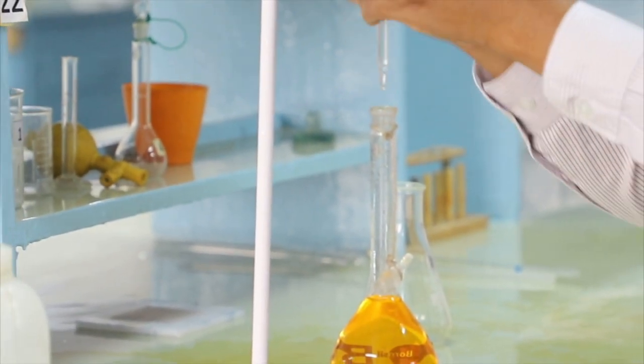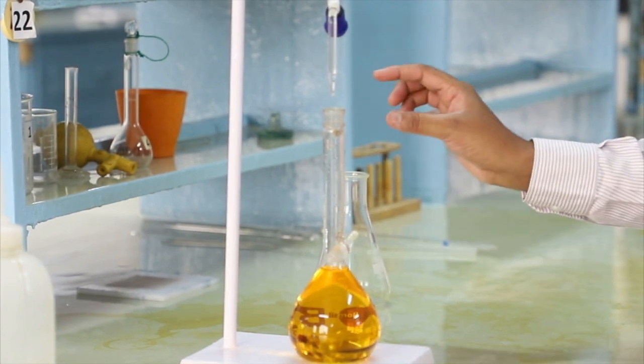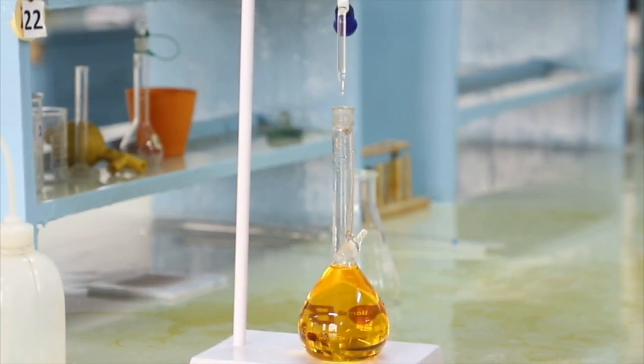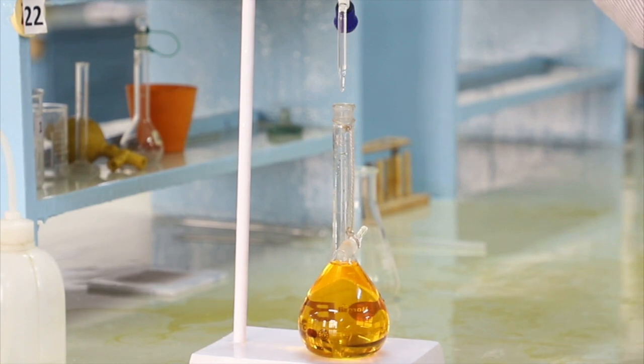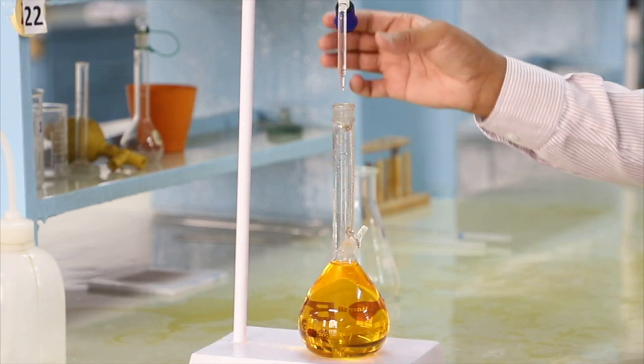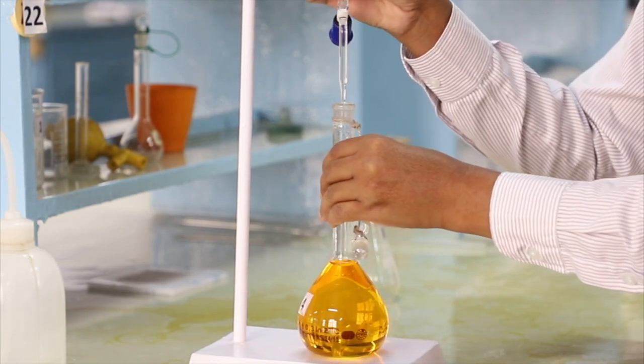So therefore I am using buret, and also the filling of this region can also be achieved using pipette. In pipette also one can take distilled water and add slowly, drop by drop. But the buret will afford you better control. So therefore I am using buret in this case.